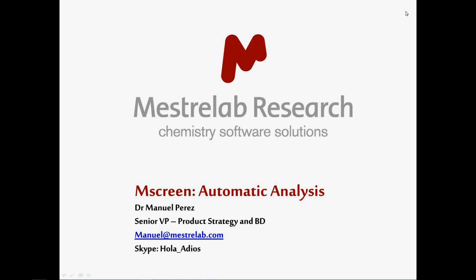Okay, once we finish this, we will jump into the software. We'll see the software in action, and we will go through other specific types of actions that we will have to take in order to automate the screening as much as possible.